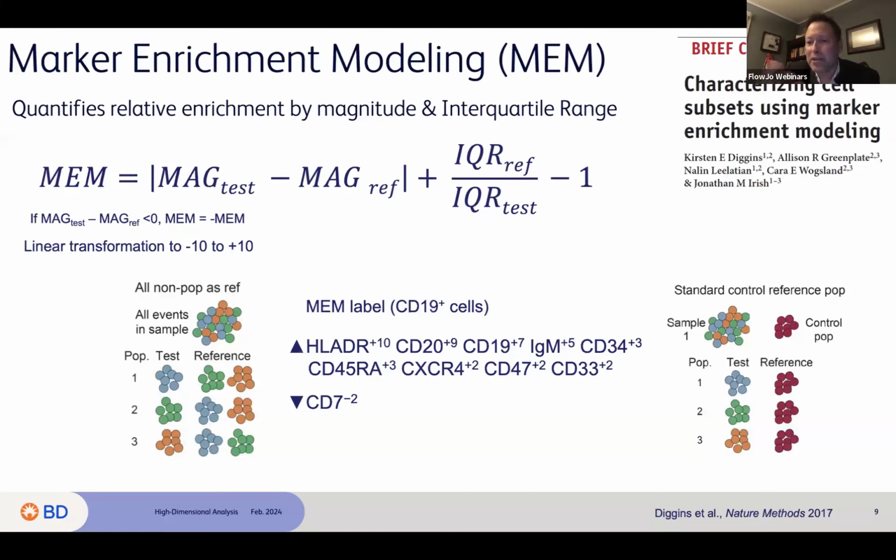You can additionally add some text later afterwards and say, this is a take your pick, and use that for making discussion easier. But you'll just have essentially a vector that describes what this population is without a lot of heuristics needed to agree on. So that's a real positive thing.